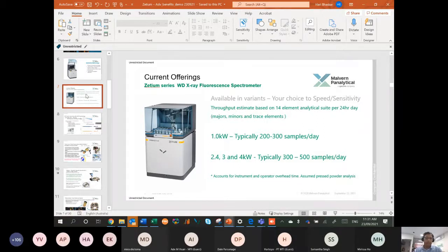Now, usually for WDXRF, there will also be what's called an instrument drift monitor setup, and the drift monitor will keep updating the intensity on a daily basis, and you don't really have to touch your calibration unless you are changing the sample preparation methodology and things like that. Then you may have to look at doing a recalibration, but otherwise calibrations don't have to be done so often. Okay.